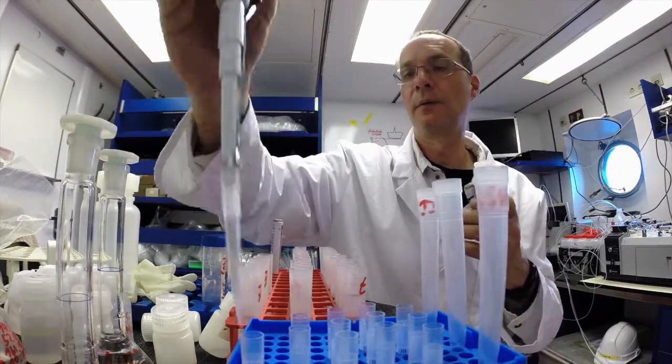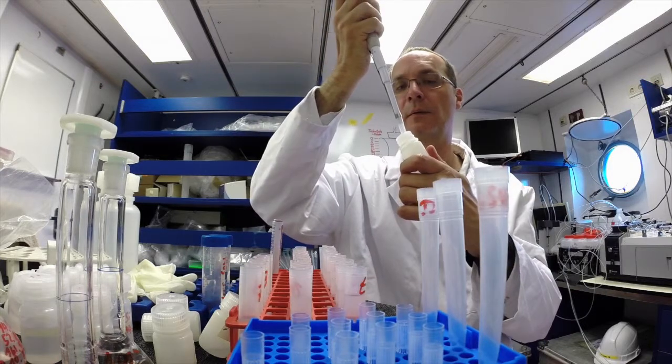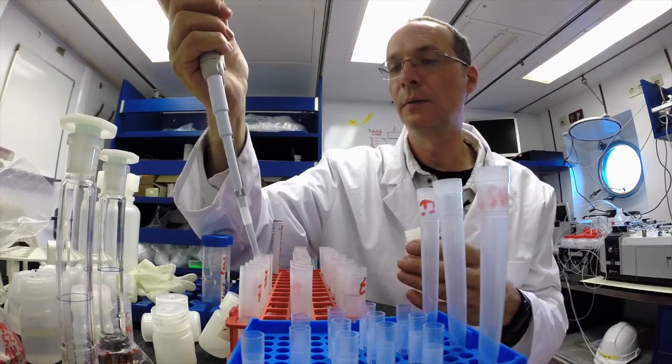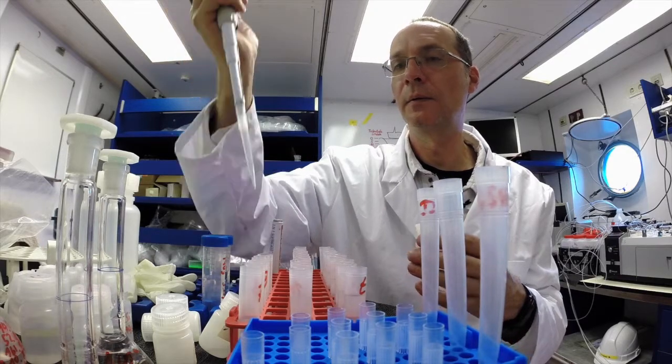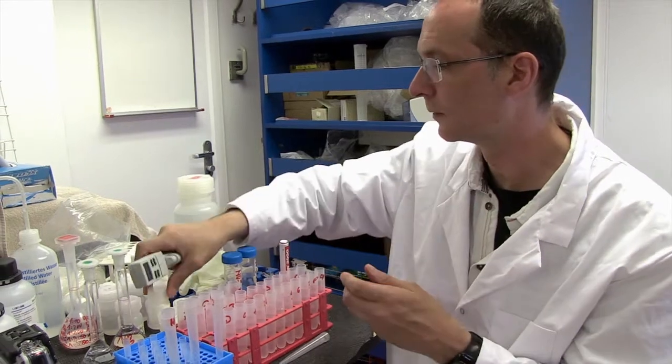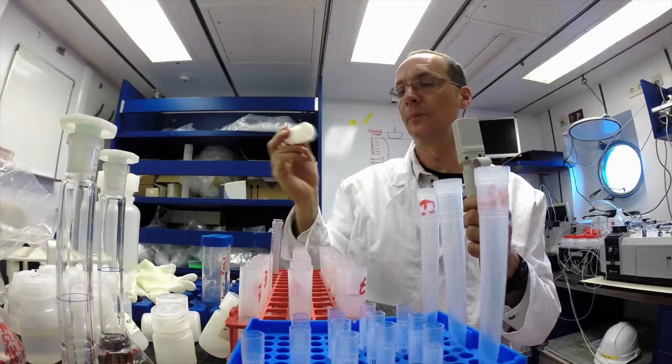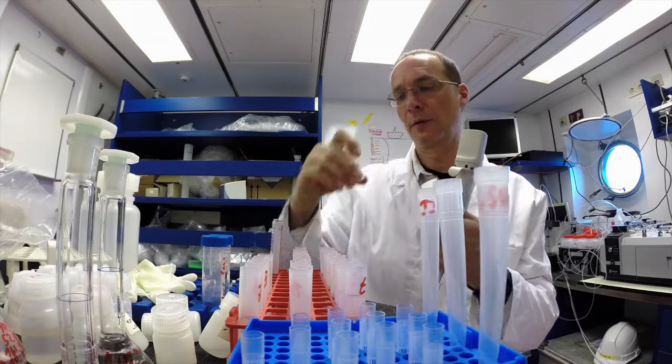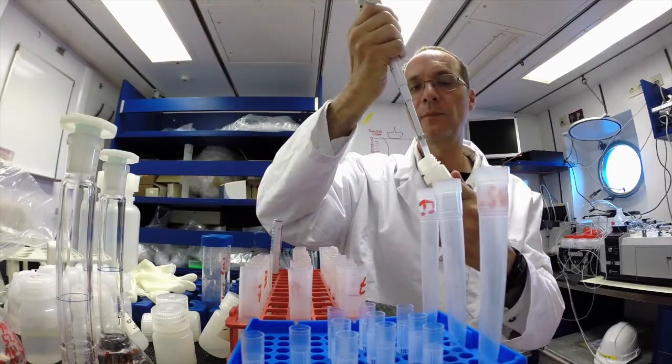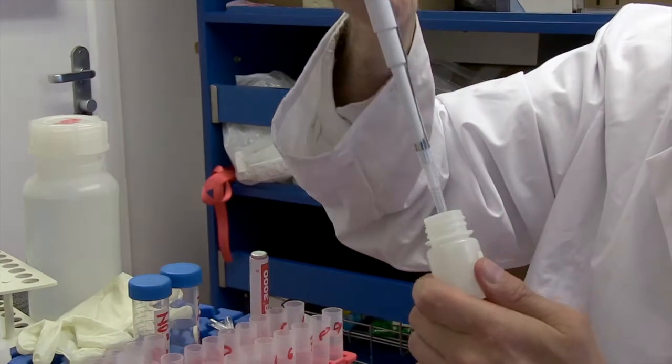My name is Matthias Birkicht. I work at the Center for Tropical Marine Ecology in Bremen. I'm currently on board the research ship Meteor, along with my research group from the Biogeochemistry sub-project with Anita Flohr and Tim Rixen. I'm working on nutrient analysis, which is a basic parameter for the evaluation of nutrient flows in the ocean.